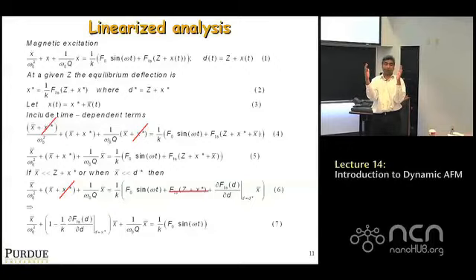Well, what's going to happen is, if there are attractive van der Waals forces, the cantilever is going to bend slightly, right? This is what we did when we did FZ to FD conversions, that at a certain Z, there's a little bending of the cantilever, right? So as it bends, let X star be the new position of the tip after it bends, okay?